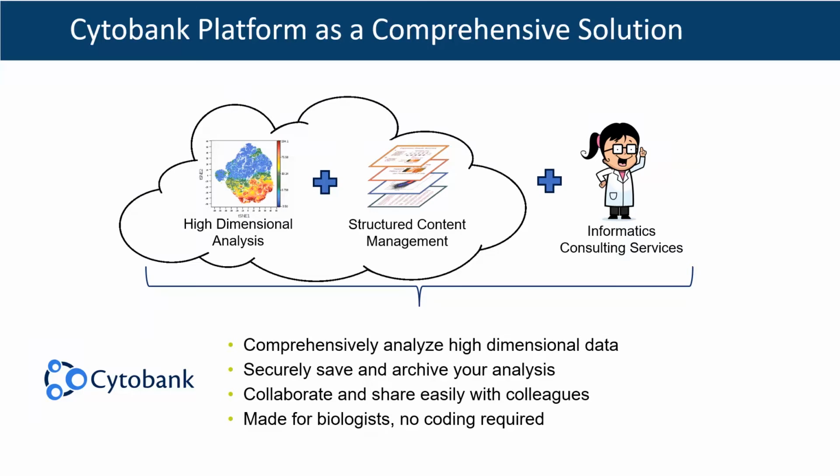And that's the gap that this informatics consulting service fills, because they have that background biology and they can step in and they can help you design an experiment, they can help you analyze your data, they can help you streamline your analysis and create pipelines and write additional code. Whatever you need them for, that's what they're there for. So it's a really great solution for customers who are looking to fill that gap.